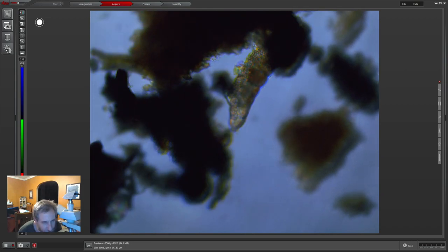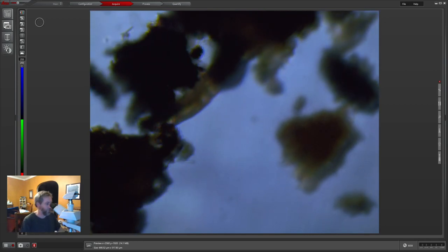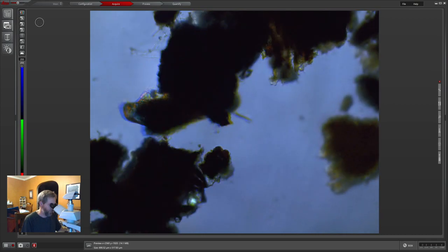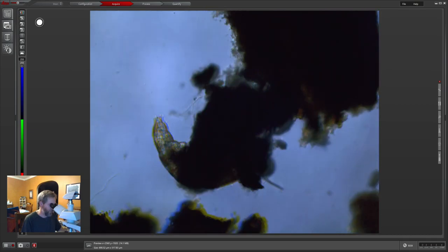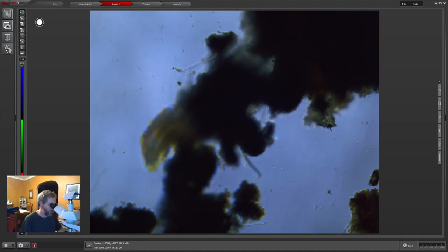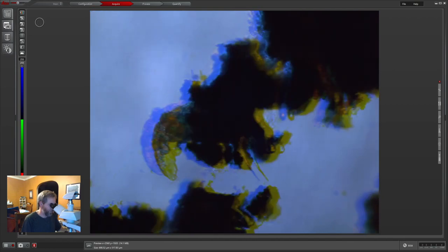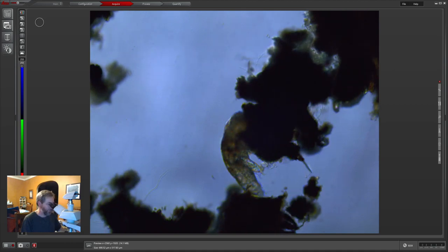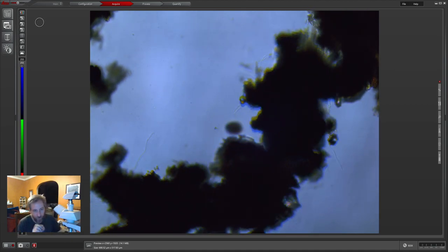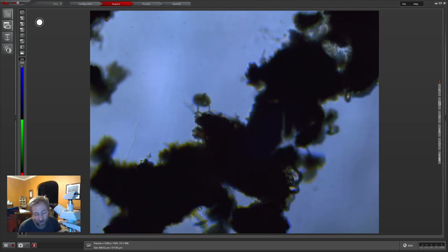How long before the eggs hatch? I have no idea. What's the black stuff? Well, we're looking at things in transmitted light, which means it's not actually black — it's just thick. It's plant material, probably pieces of lichen, which is what I scraped this sample from. Because the light in a light microscope like this is coming from the bottom, anything that's thick or opaque doesn't let the light through, so it looks black.